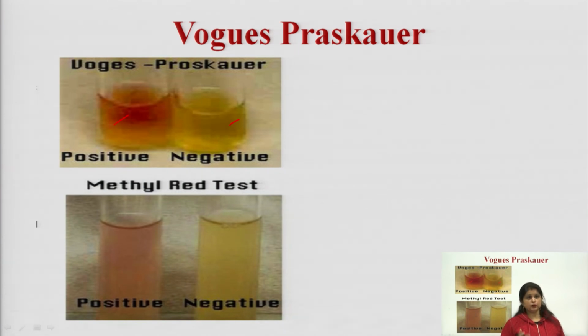So, these two tests are related to your biochemical tests: one is the indole test and the second one is the methyl red Voges-Proskauer test.